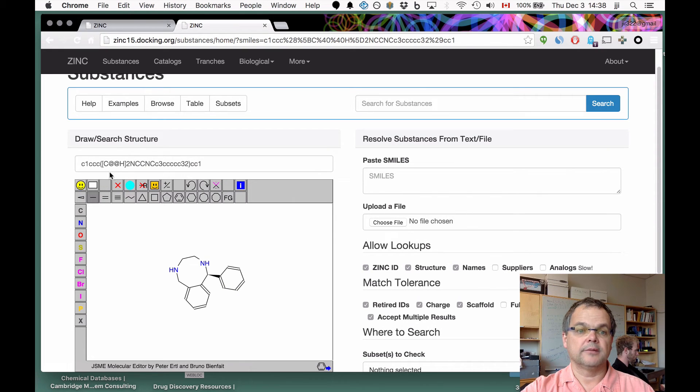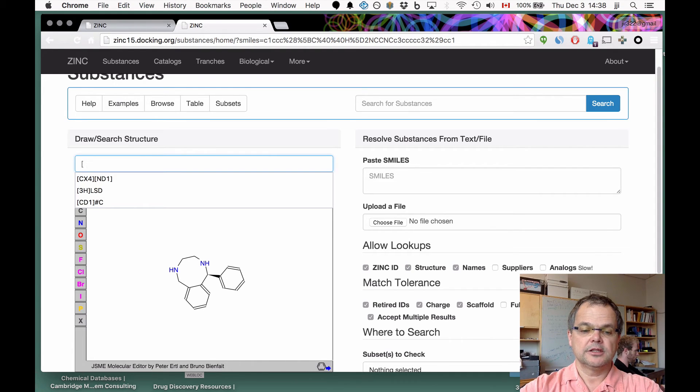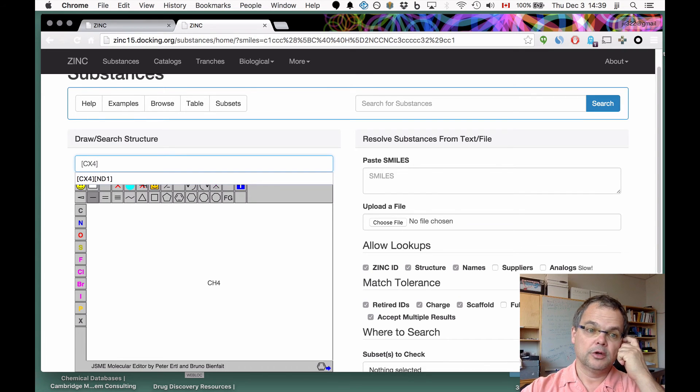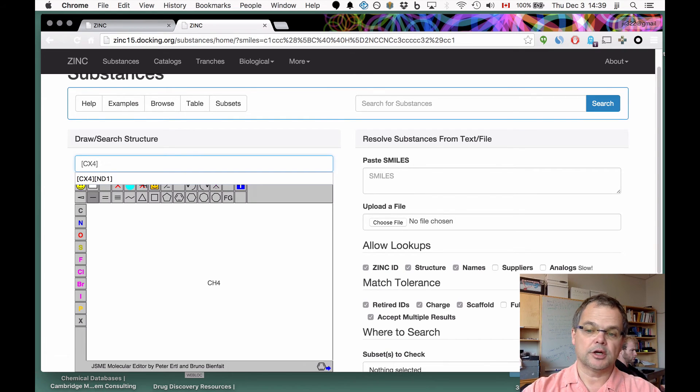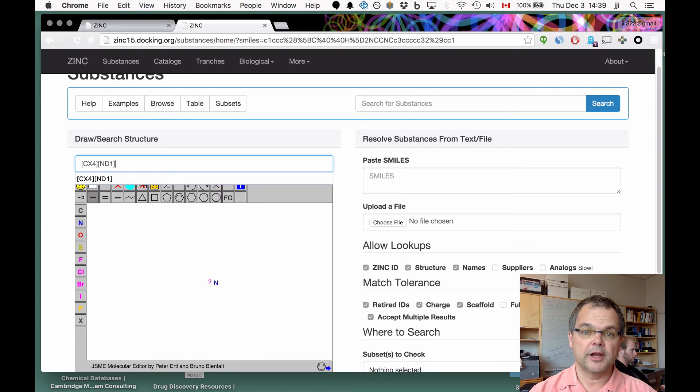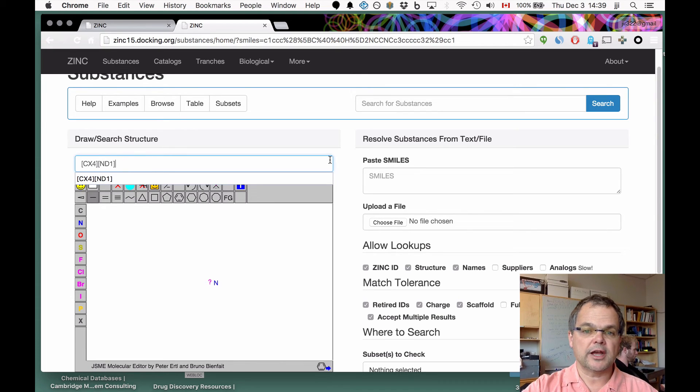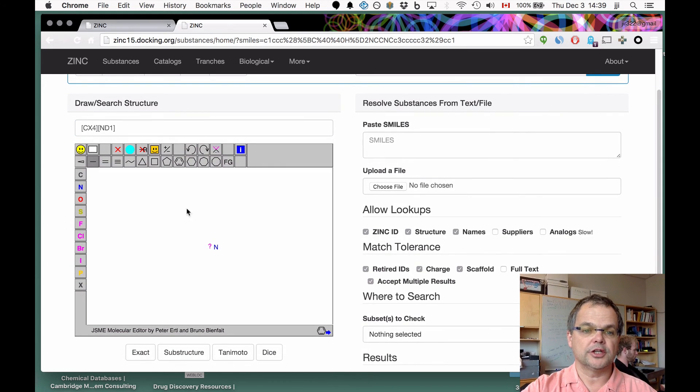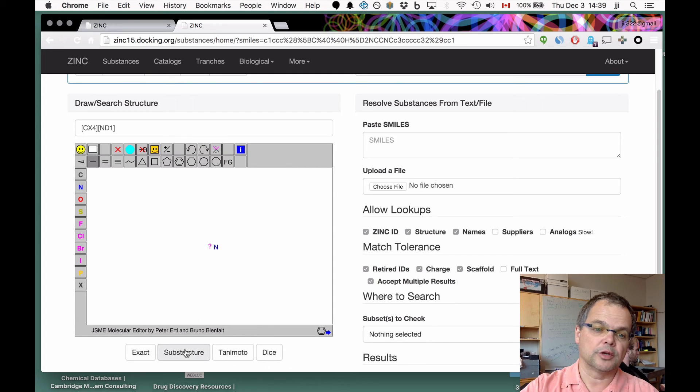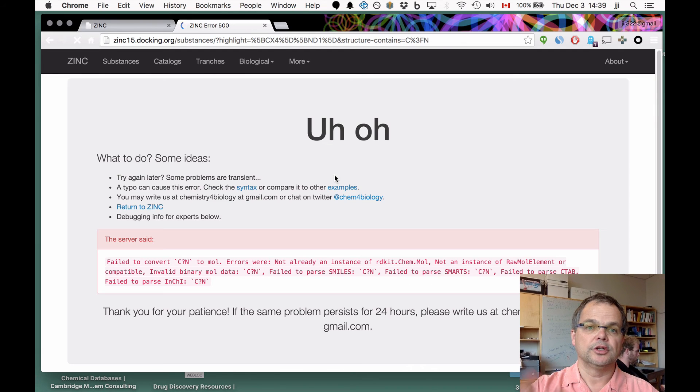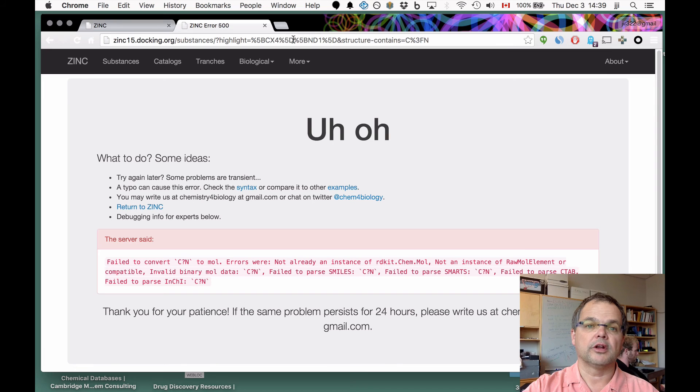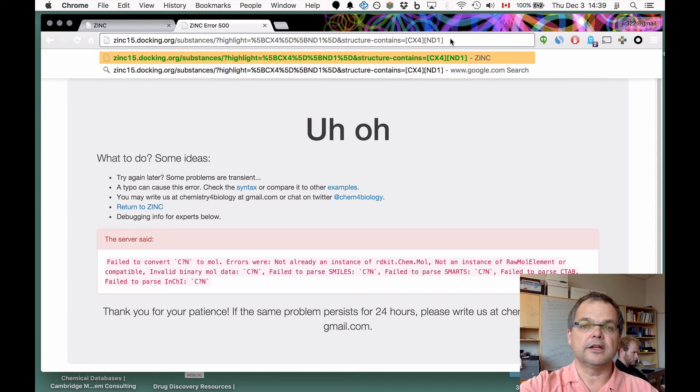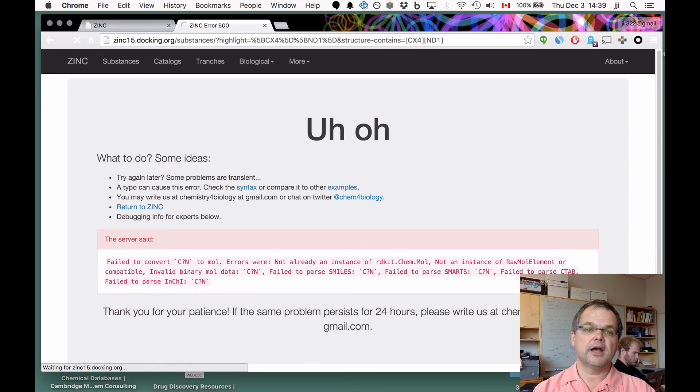You can also search for SMARTS. For instance, if you wanted to look for aliphatic amines, CX4, so a carbon with four substituents, an sp3 carbon, ND1, a nitrogen with one heavy atom substituent, so effectively a primary amine. If you search for that using the current system, you'll notice that the picture didn't get transferred correctly. This gives me a chance to tell you that this is an area we're still working on. If you try to do a substructure search using this tool, you'll get an error.